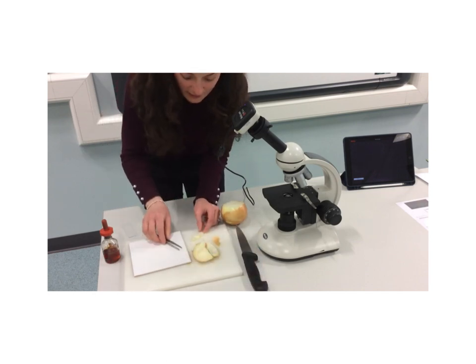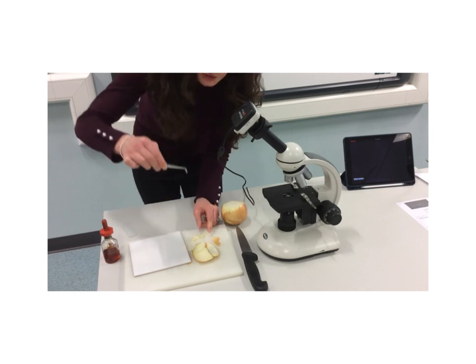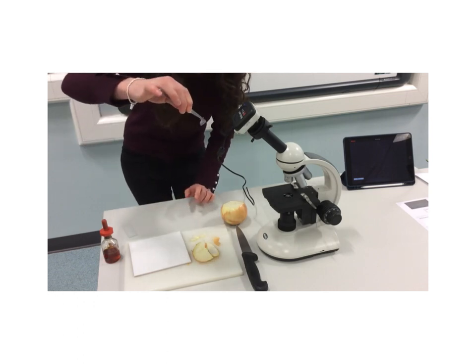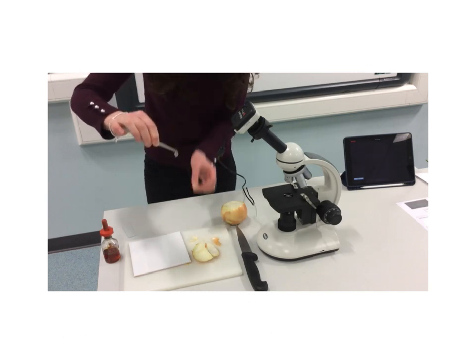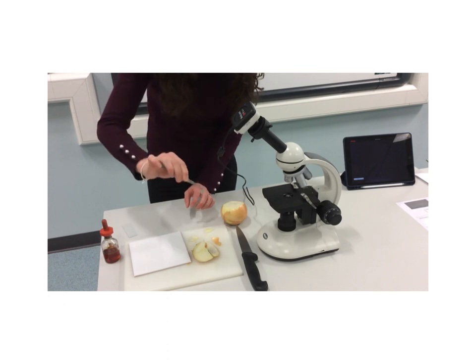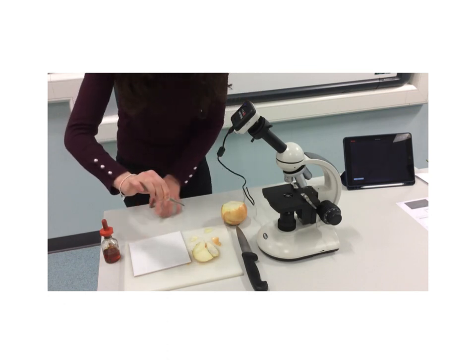Okay, so let's see if I can get that without ripping it. I'm not sure whether you can see that in the video, hopefully you can. But there is just one really thin layer, so not even like a slice of onion, you're literally thinking one thin layer of the onion skin.